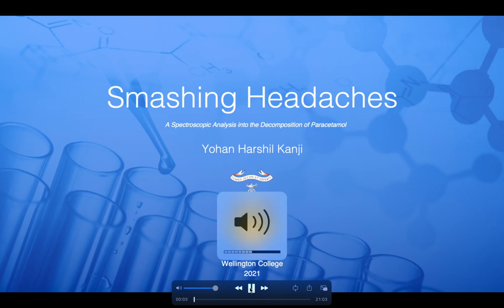I'm a Year 13 student from Wellington College, and I would like to introduce you to my project, Smashing Headaches, which is a spectroscopic analysis into the decomposition of paracetamol. And I'll let you work out the play on words for yourself.